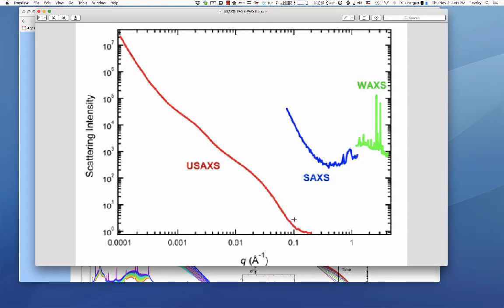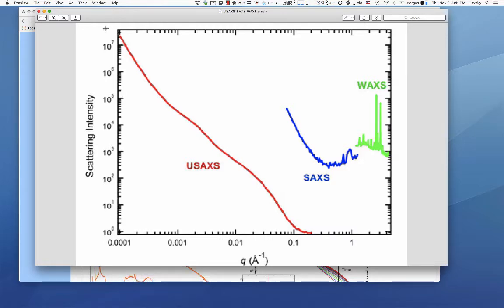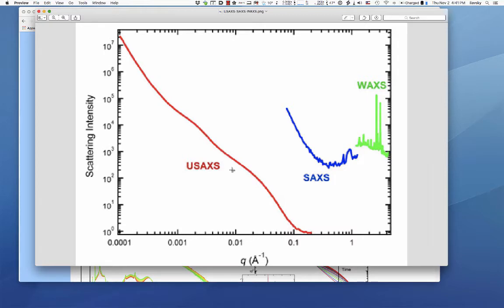This sketch from one of our publications shows the red curve as USAXS data, starting around 10⁻⁴ inverse angstroms — a very very small angle, essentially our instrument resolution. We actually measure down to q equals zero but can resolve data around 10⁻⁴ inverse angstroms in standard resolution. The USAXS collects data all the way up to about 0.2–0.3 inverse angstroms, at which point we typically run out of photons and have only electronic background.